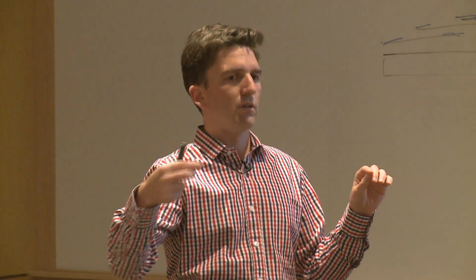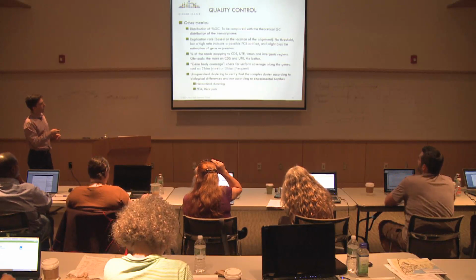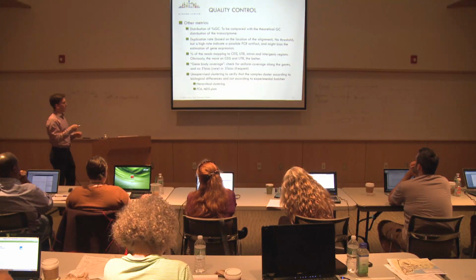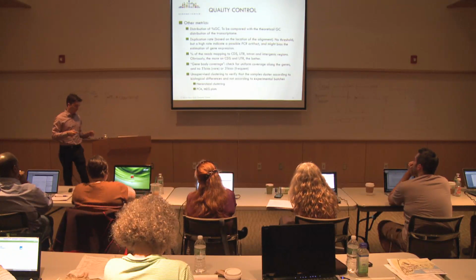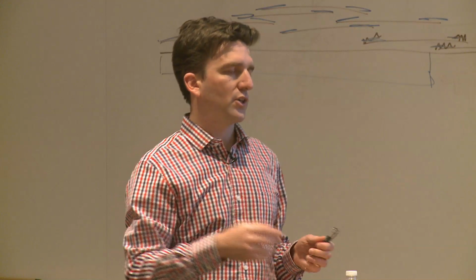That's additional information that this sample might be very wrong. Hierarchical clustering or PCA or MDS plots are useful too. Take the RPKM matrix and do a very classical hierarchical clustering.